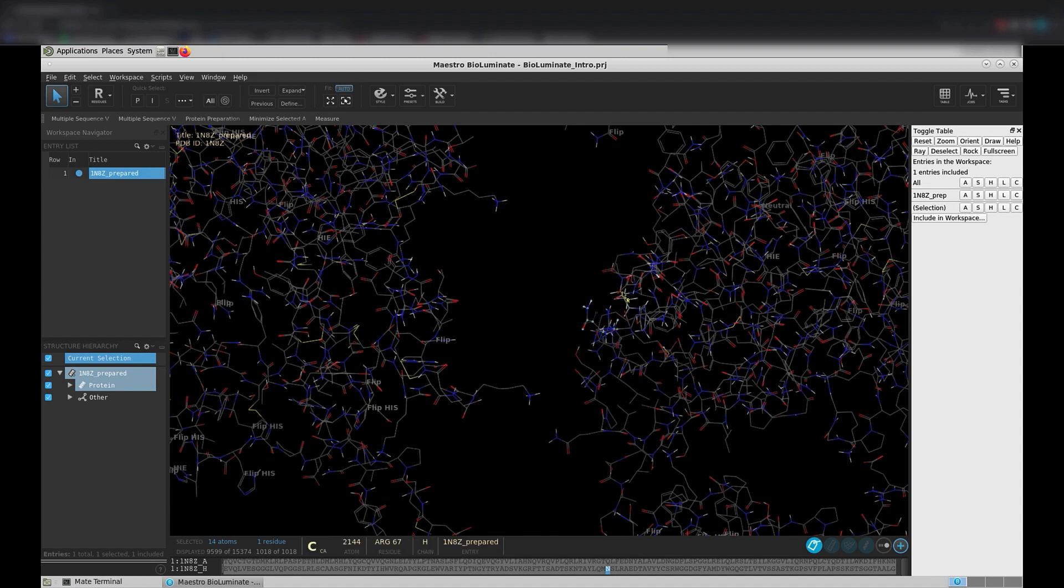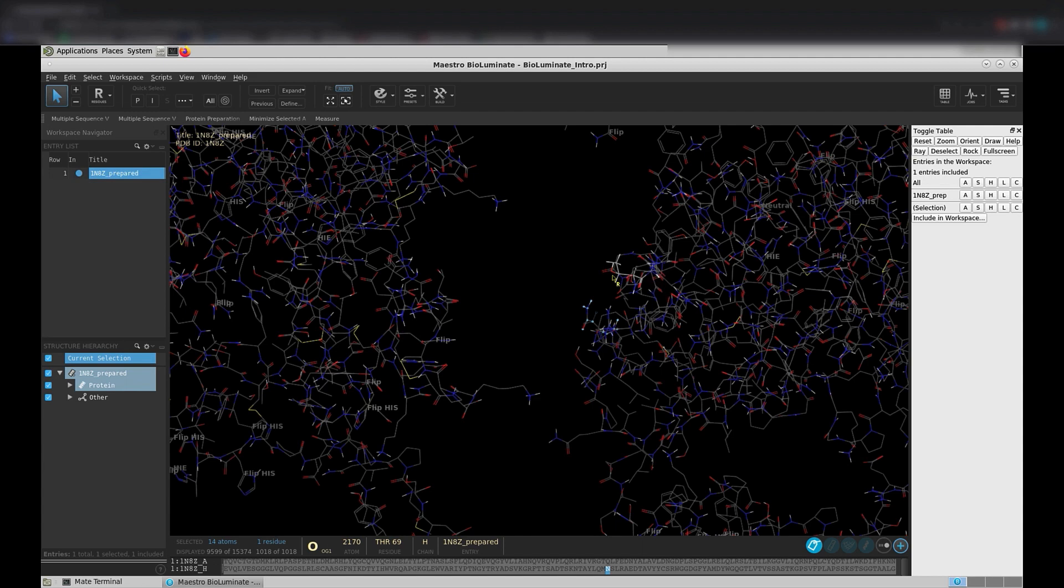And you should notice that all the atoms in the residue are highlighted in blue. Also, notice that residues under your mouse will highlight as you hover over them. Use this predictive highlighting to help you know what you are going to click on before you click on it. This is especially useful when you have a crowded workspace.